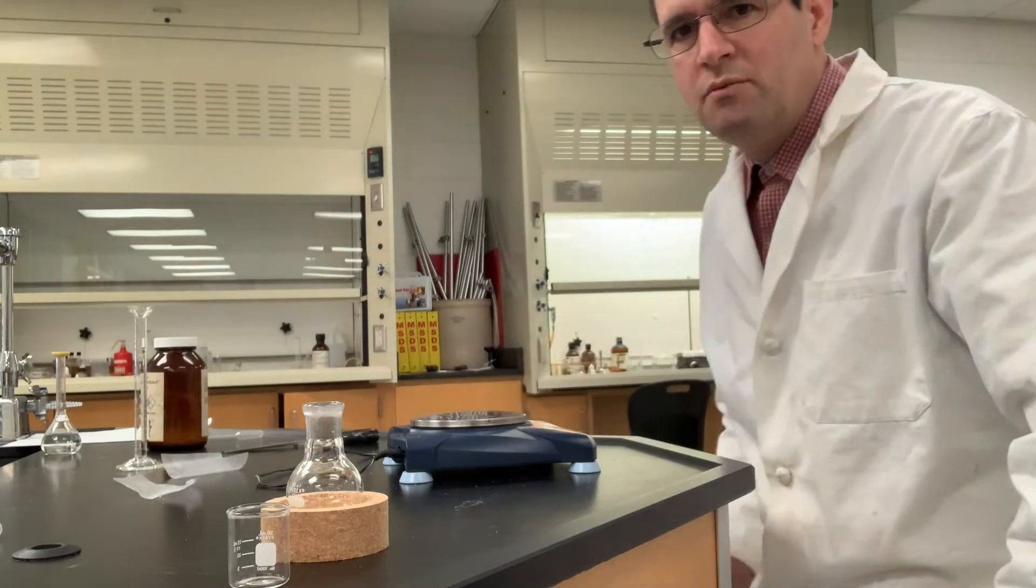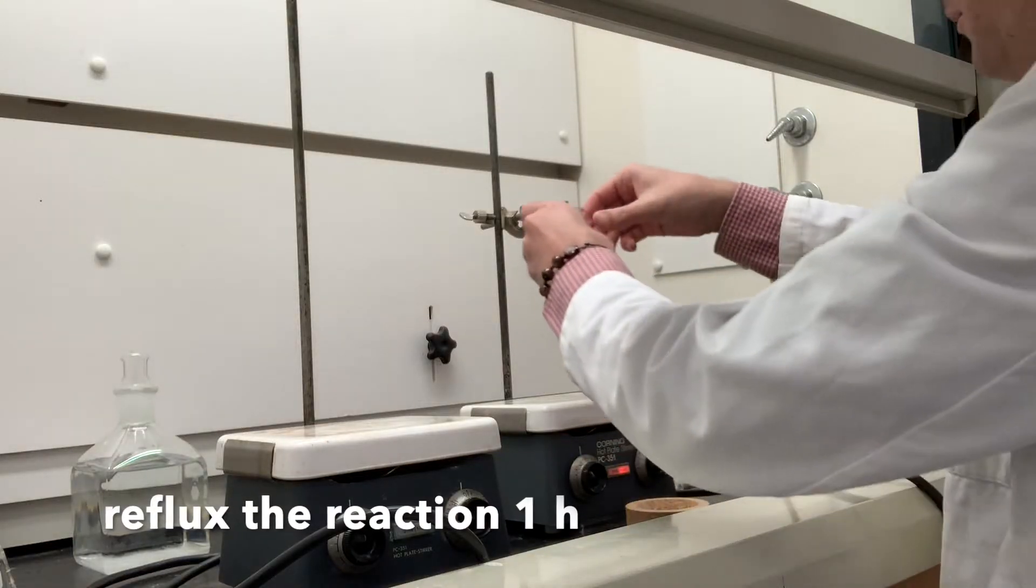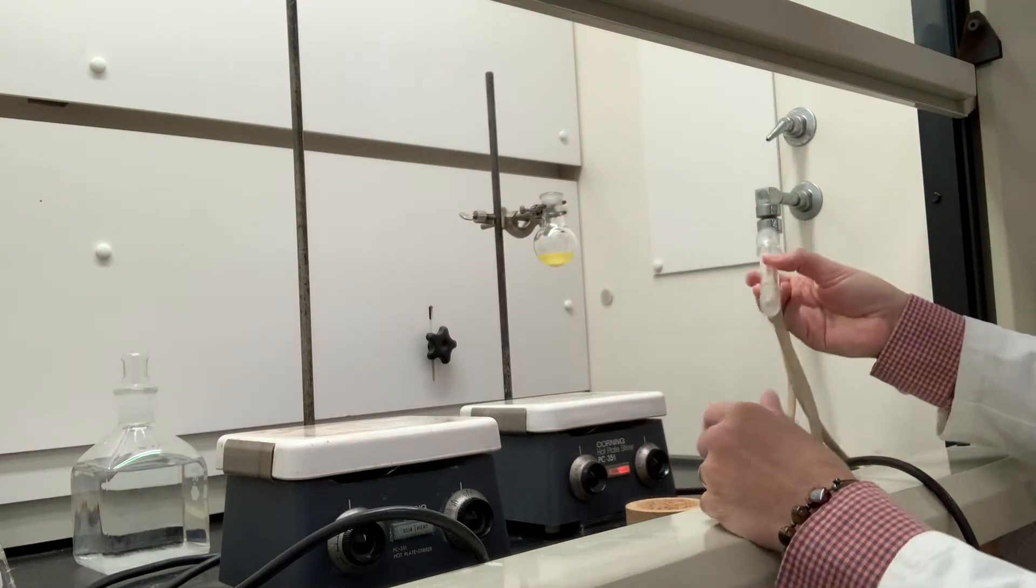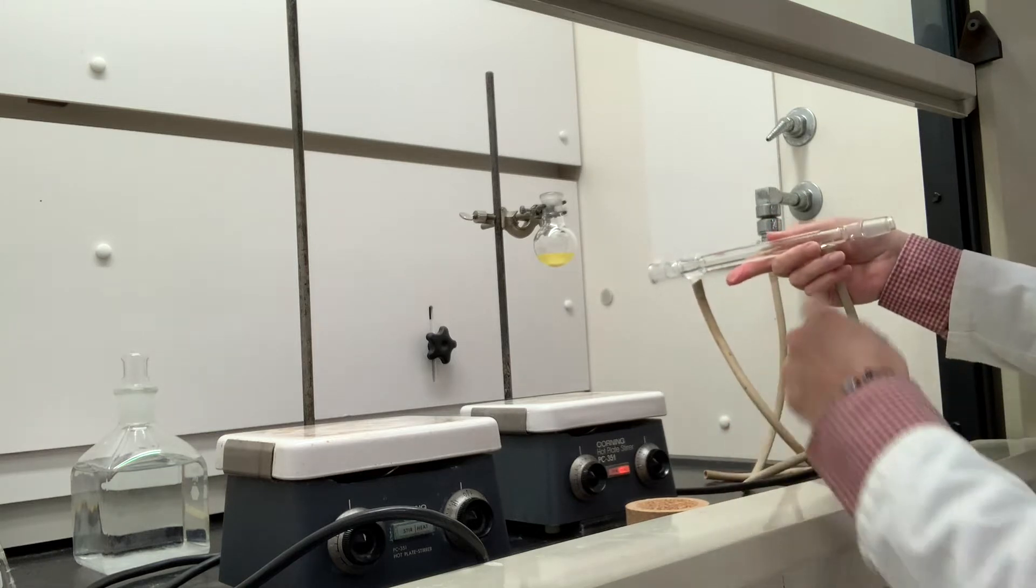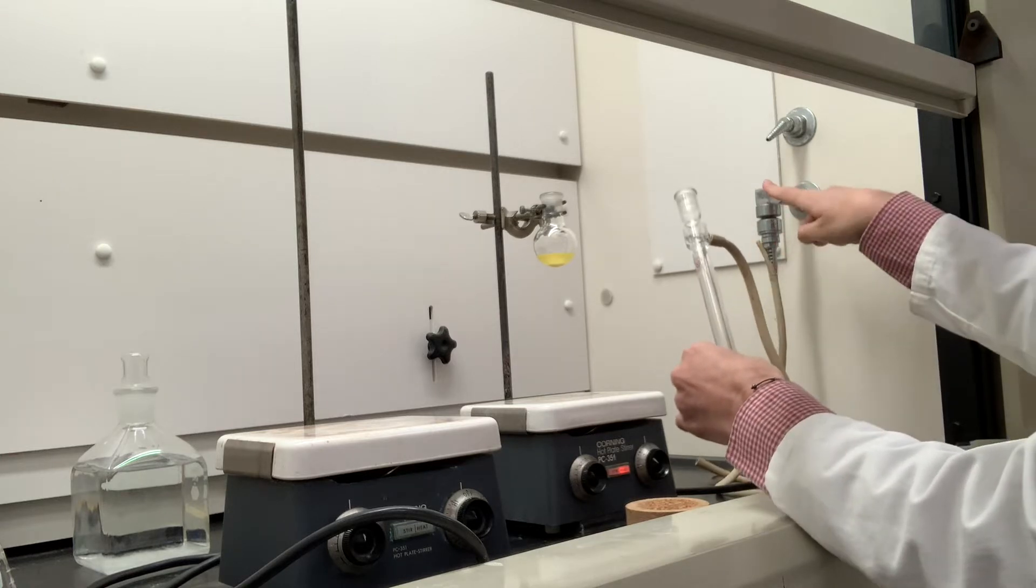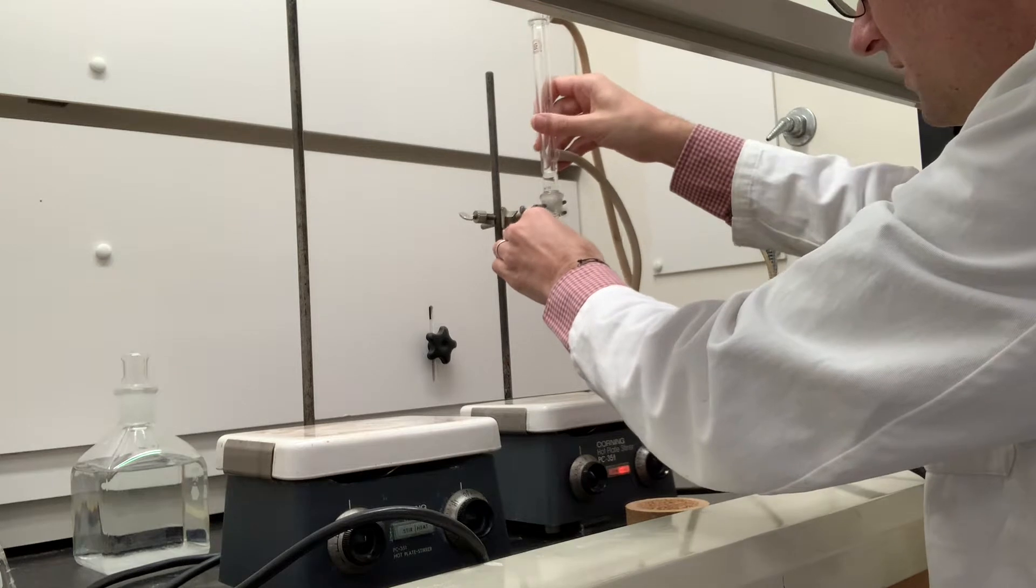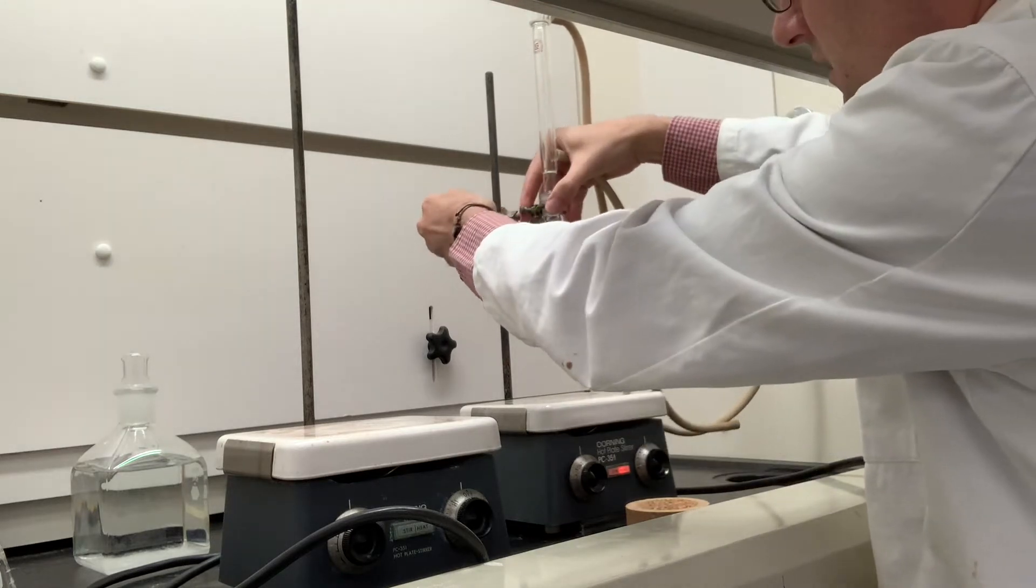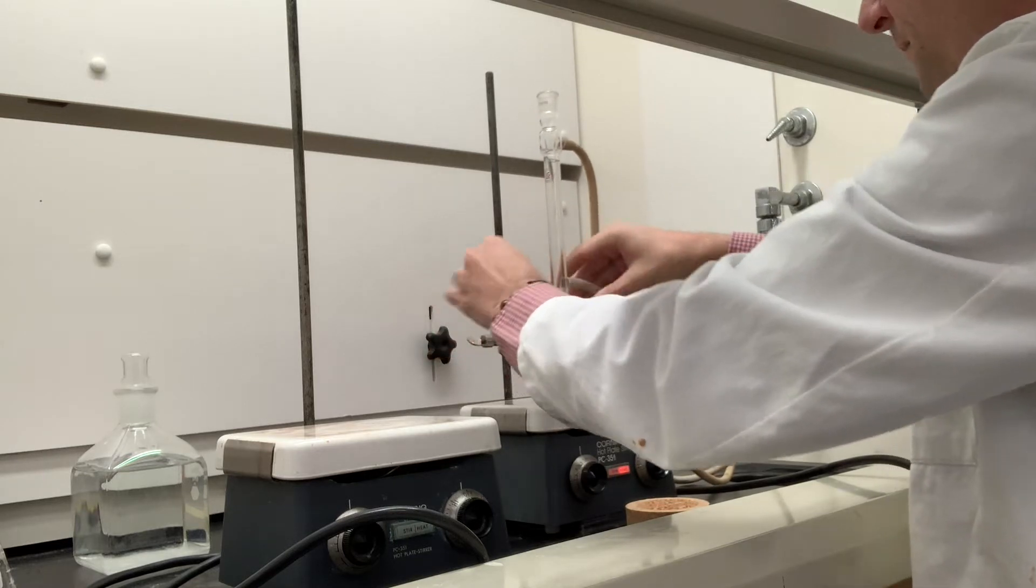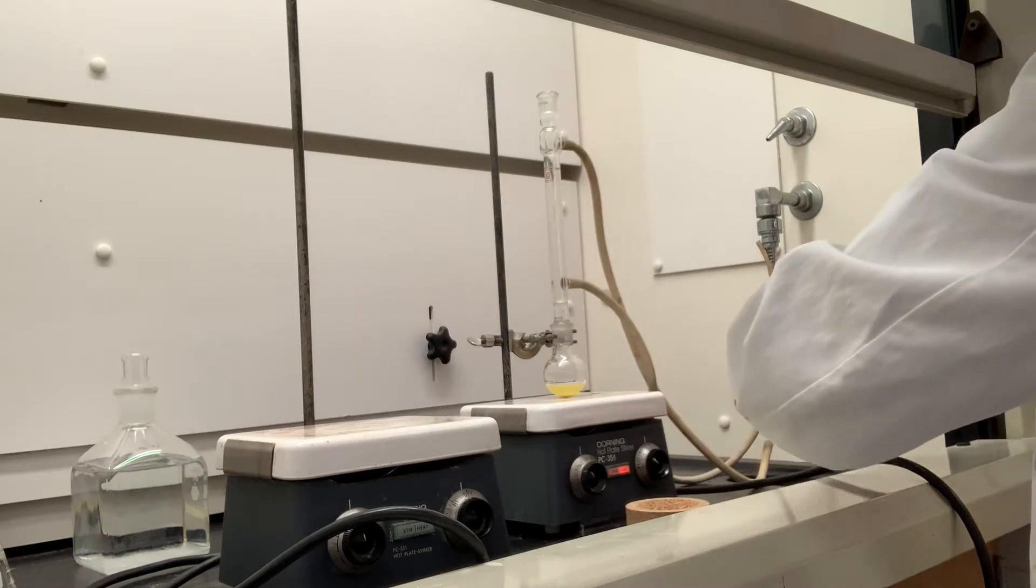Then we set this up in the fume hood behind me for reflux. Here's our fume hood. We want to clamp our flask above the hot plate and use a circulating water condenser. Here's our reflux condenser hooked up to the water on the right. We'll detach this and carefully bring it down to contact the hot plate. I will start the water circulating here.